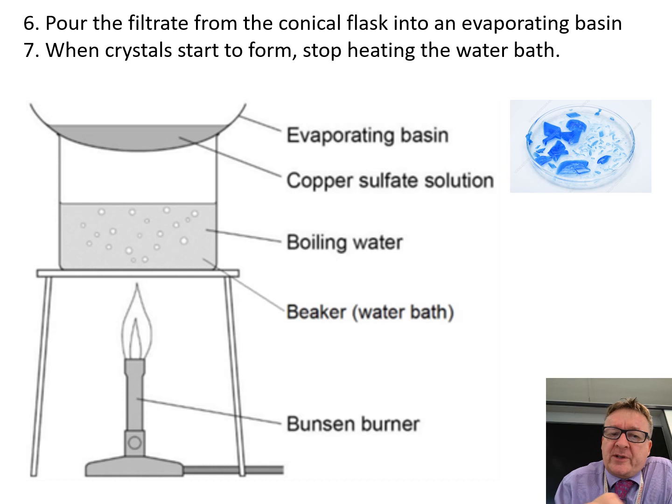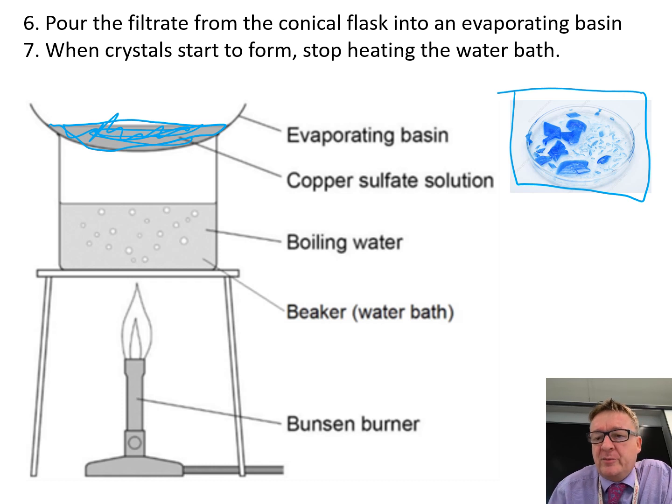Pour the filtrate from the conical flask into the evaporating basin. When you start to see crystals starting to form, stop heating it and take it off. Eventually you should see lovely blue copper sulfate crystals appearing.